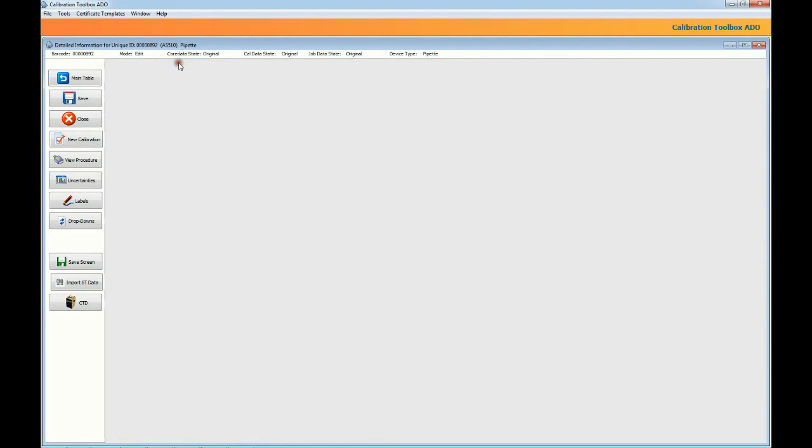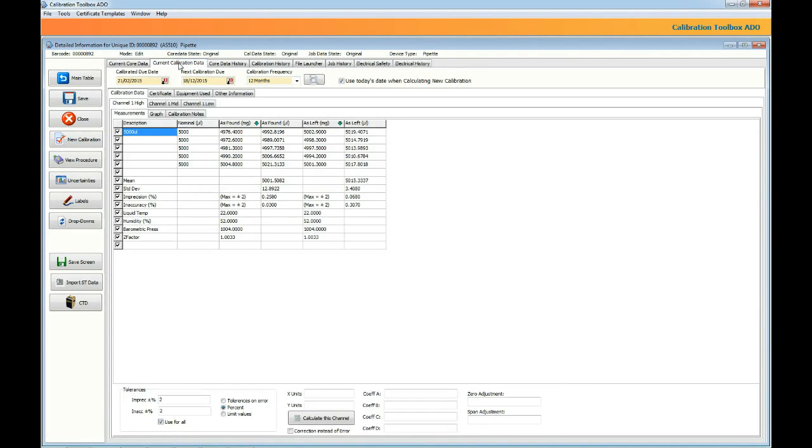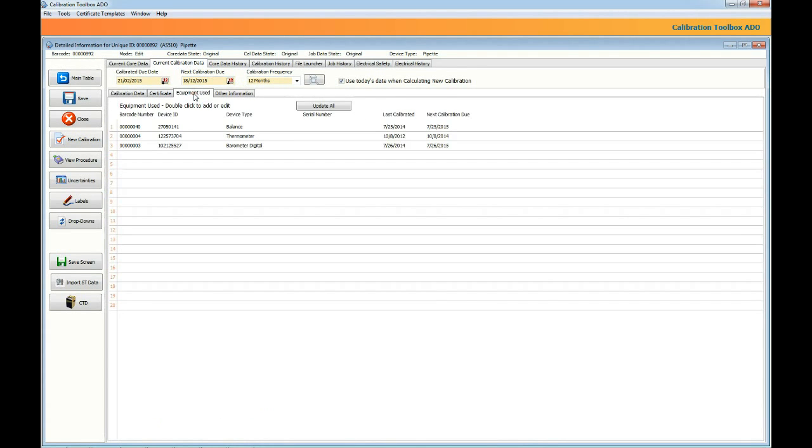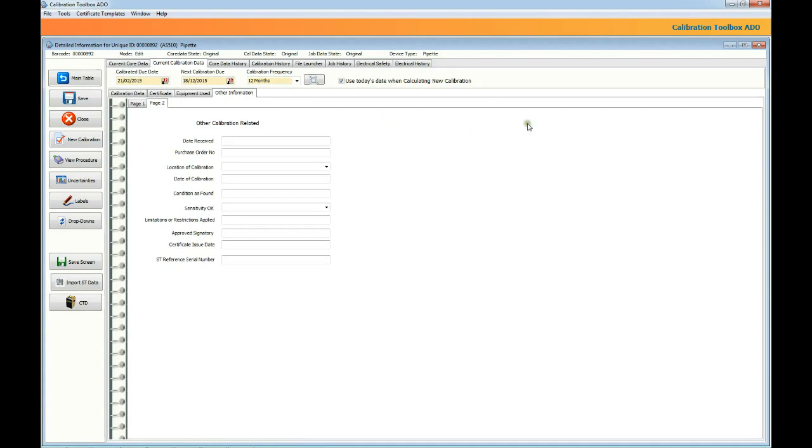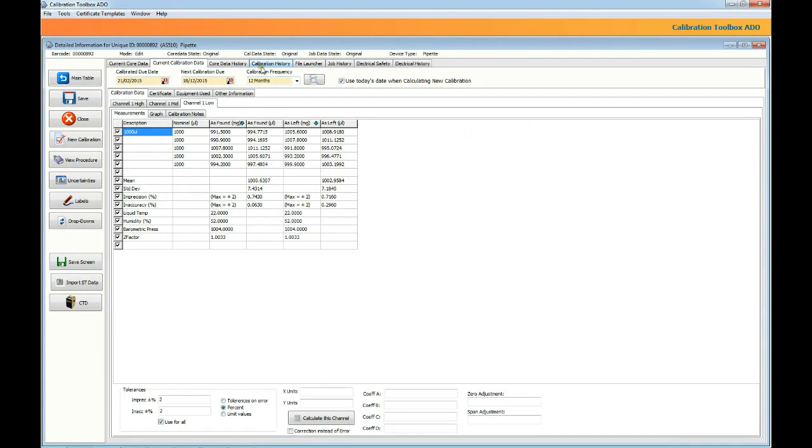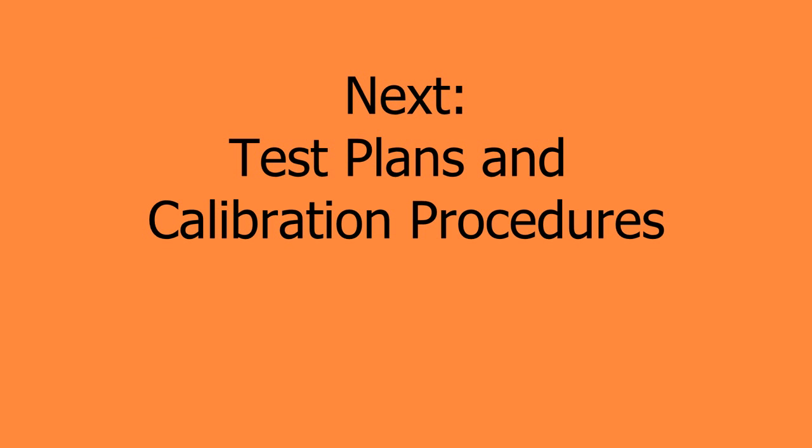We've also got the calibration data which you'd expect to see from a pipette calibration, as found, as left. The water weights that were recorded and the volumes that were calculated from the Z factor based on temperature, humidity and pressure. Very importantly we maintain a record of the equipment used in the calibration for traceability and various other pieces of information all relating to the calibration. Also because calibration toolbox isn't just for pipettes we can support other information as well such as portable appliance testing if need be.